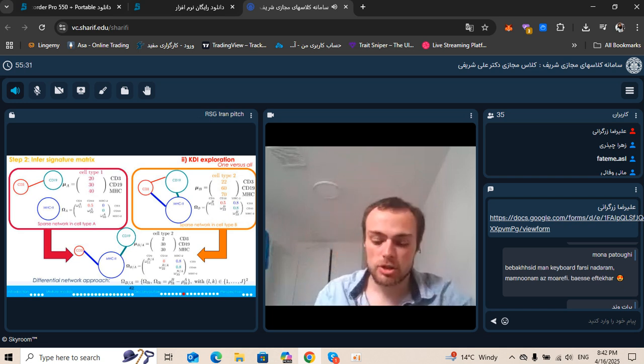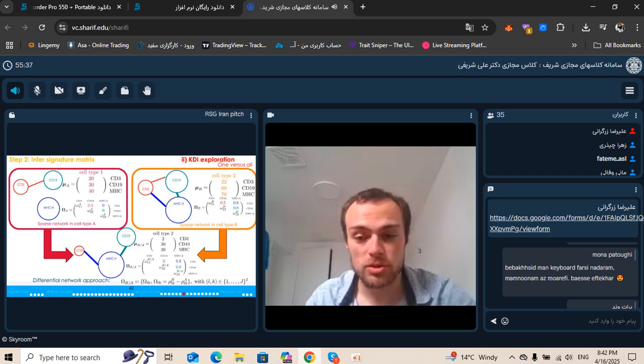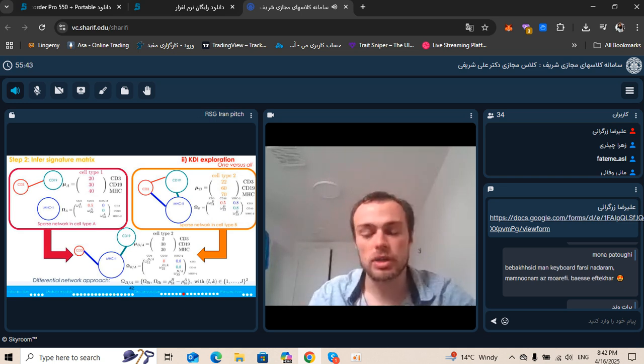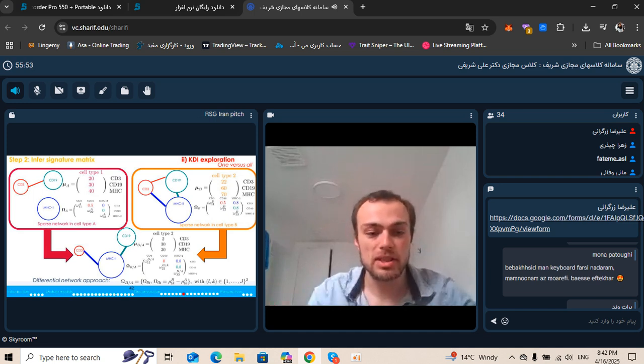Okay, so here I'm now considering that I've been able to retrieve the networks for each of my cell populations. But still, I usually come up with too many markers. And there are 2 or 3 benchmarks that definitely show that the best performances were reached when you are trying to minimize the subset of markers required for characterizing your cell population. So how to determine the minimal set of markers to characterize a given cell population?